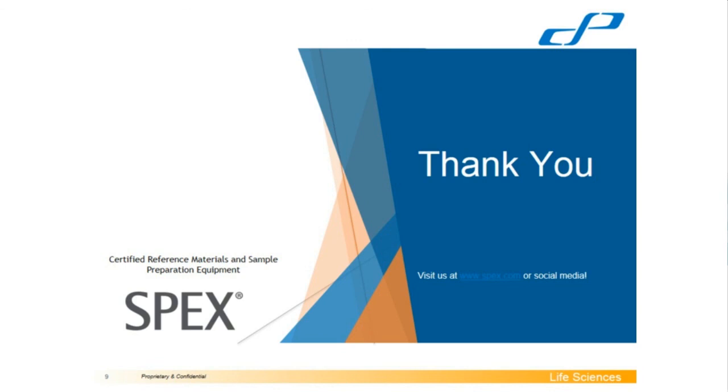Okay, brilliant. Thank you, Patty. Is there a mix of solvents which is best for flushing out a HPLC system?